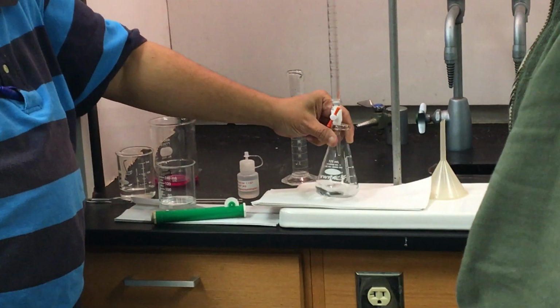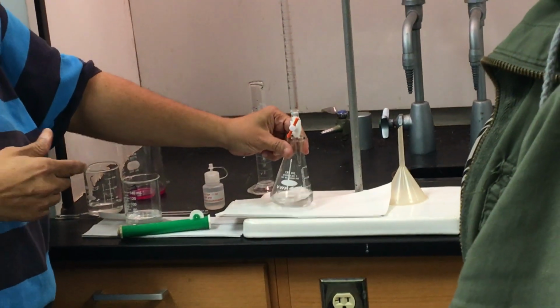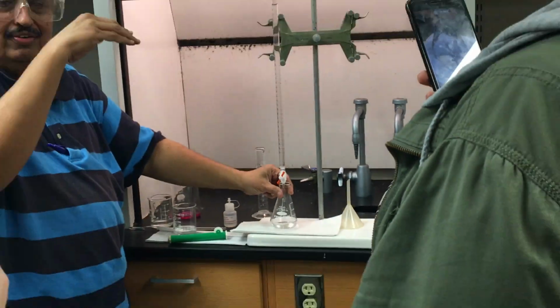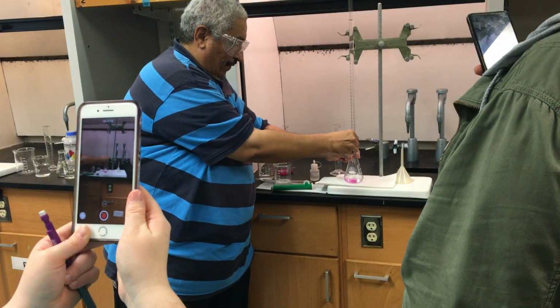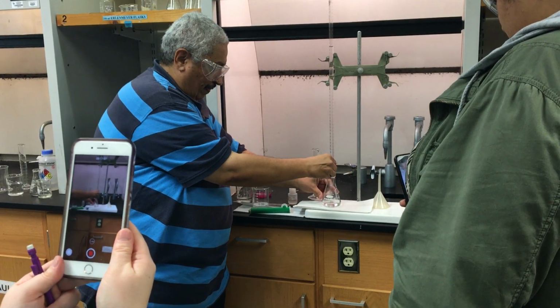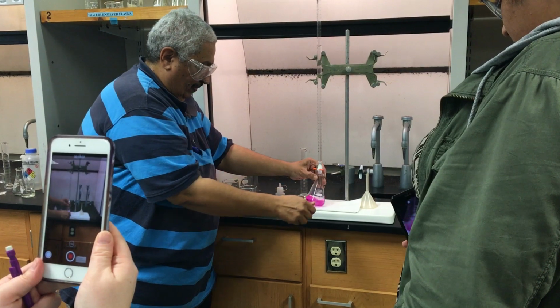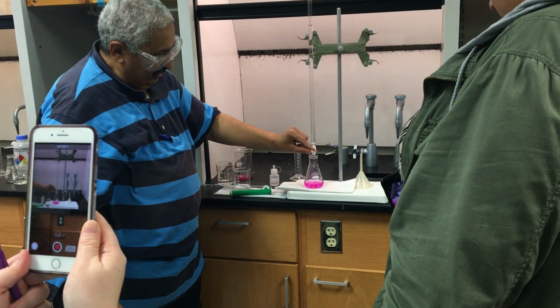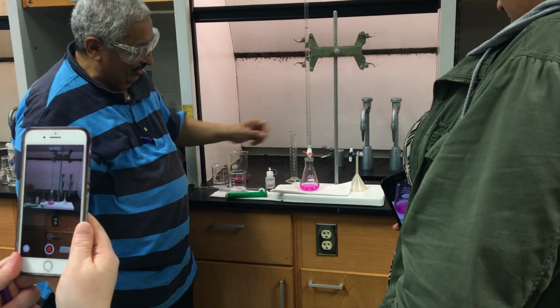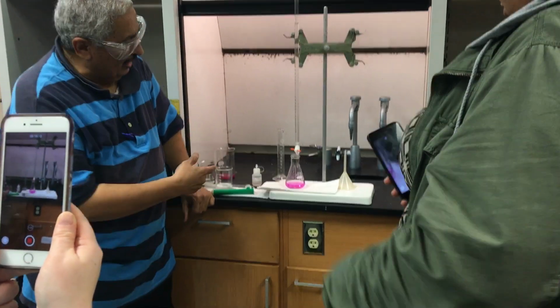Just keep adding. This takes time. The first trial is time consuming because I don't know where the end point is. The second one is easy. I'll let it run to very close to the value, correct? So here it is. Okay, so here it is. Yeah, that's a little bit, one drop off, correct? One drop, maybe I added more, but it is light pink, but it can be lighter if I go one drop out. So it's not bad.